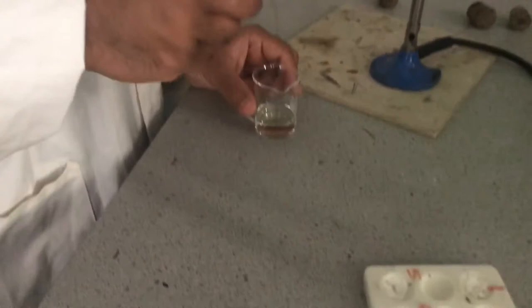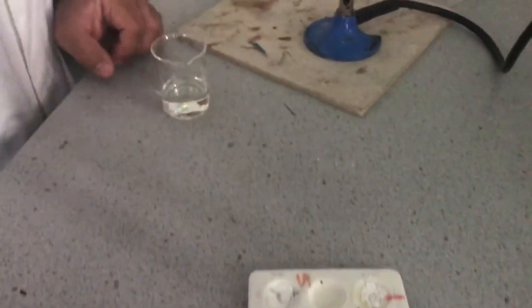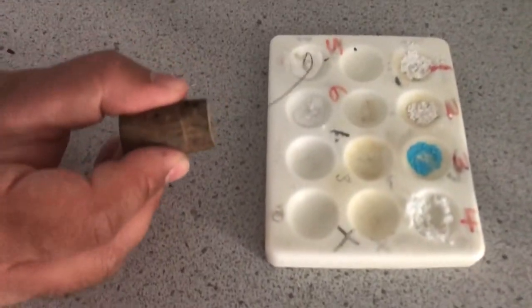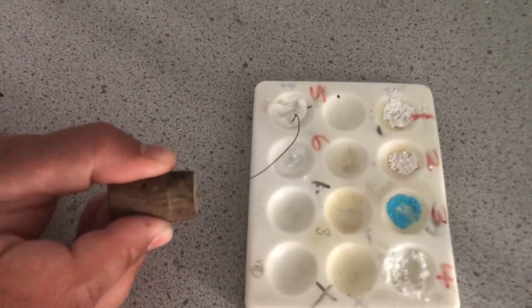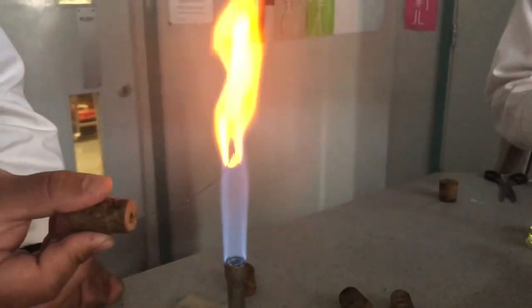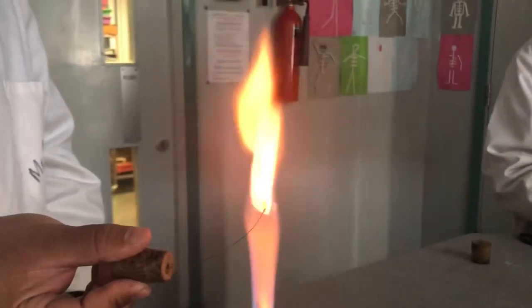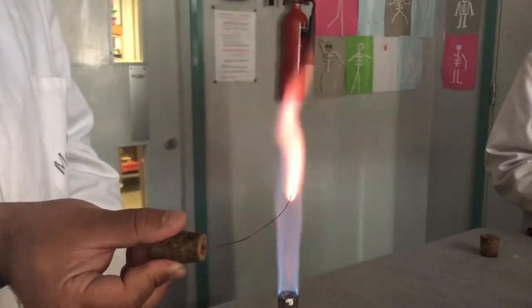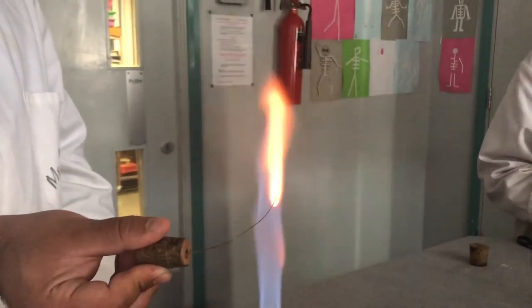There we go. Now moving on to the next compound. With my clean wire, again, just place a little bit of that metal compound onto the loop, back into the Bunsen burner flame. This is giving us a lilac color. It's a bit harder to see this one, but you can see faint lilac color, especially here at the top of the flame.